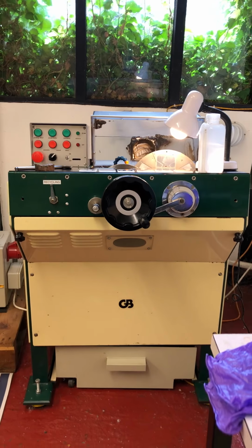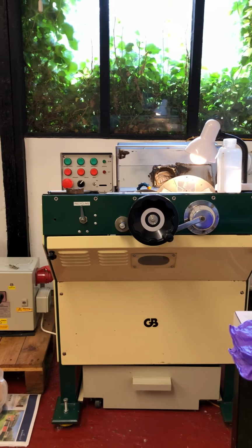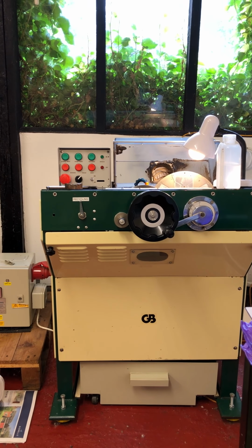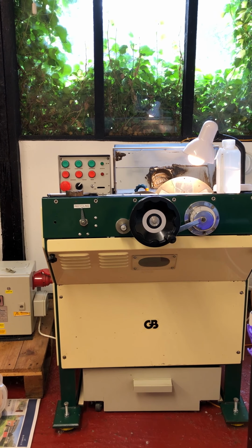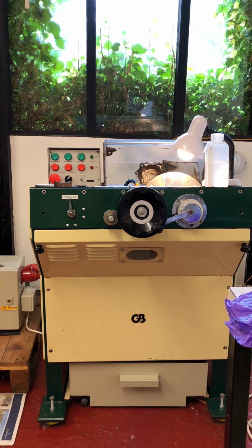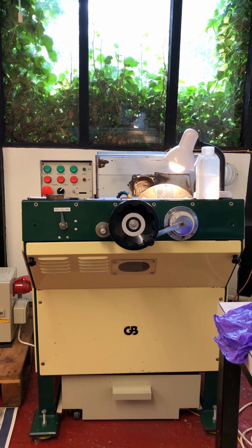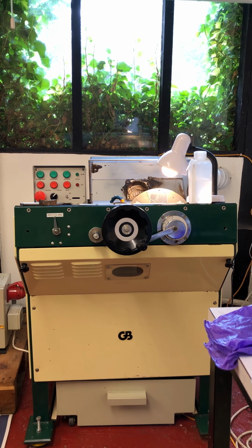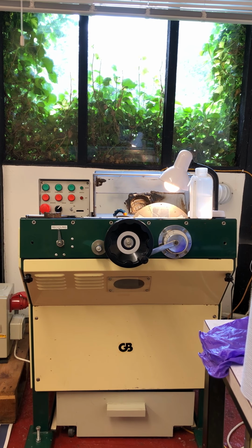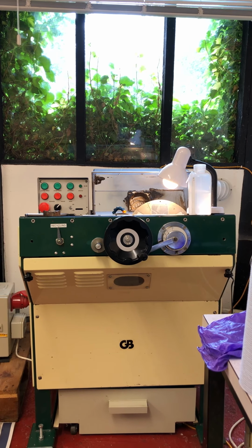Now you're looking at the main body of the machine behind those metal plates, and that contains its motor, drive belt, but more importantly it contains a pump which sits in the settling box. Now that pump takes the oil that's settled and it recirculates it up to the top and sends it through the oil spigot between the grinding wheel and the sample plate.